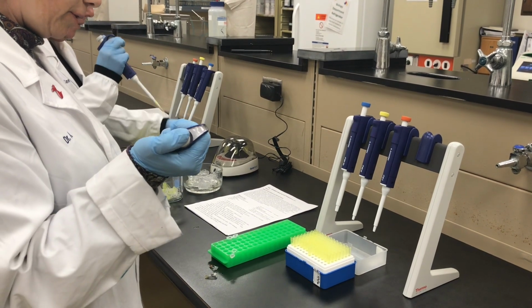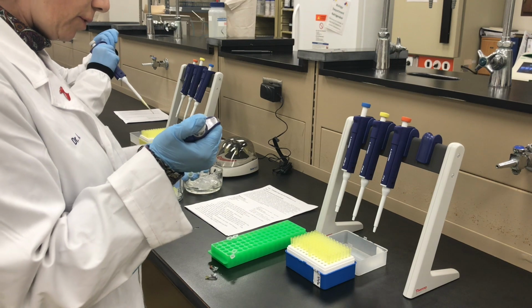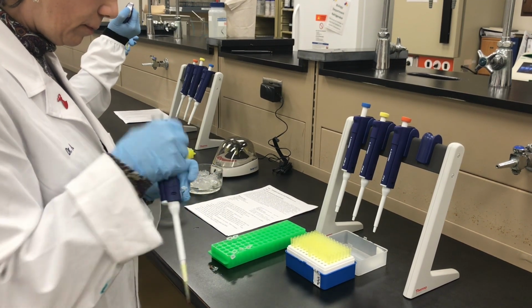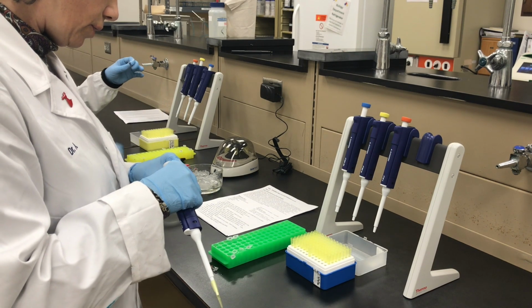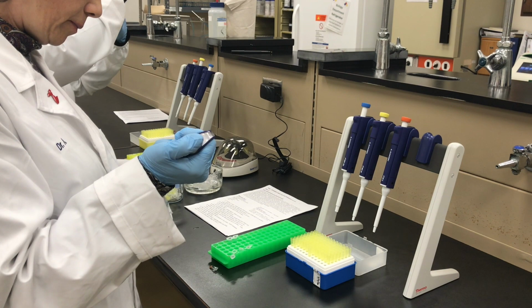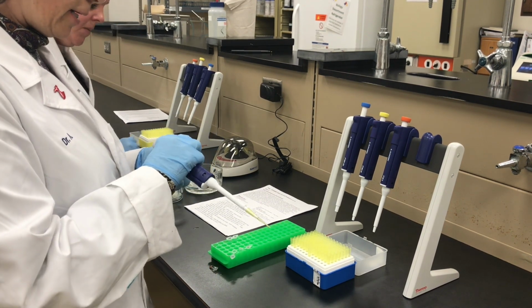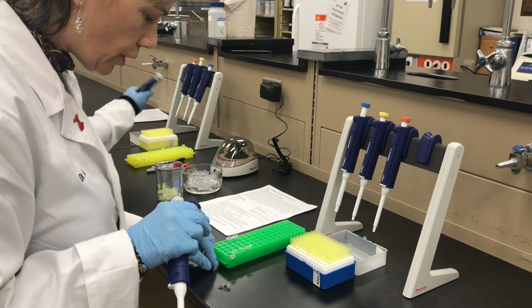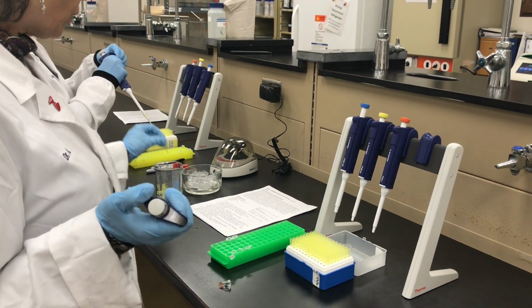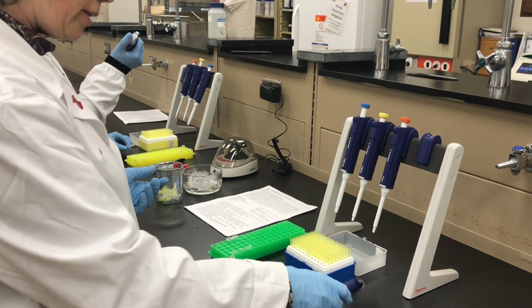So tube number 2 for this one is going to be a P, positive control. Tube 2. Now, more recently, they added color to some of these solutions, so that if you got all your ingredients, you should come up with orange, because we had a yellow solution and a red solution.